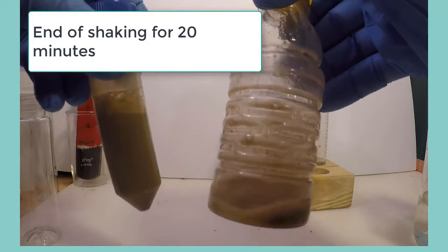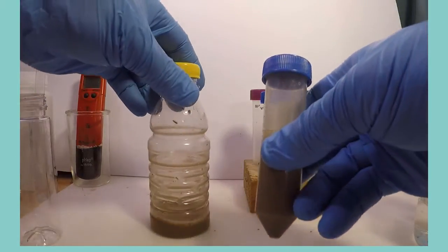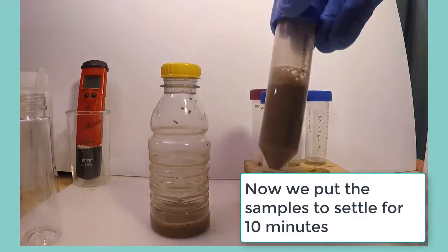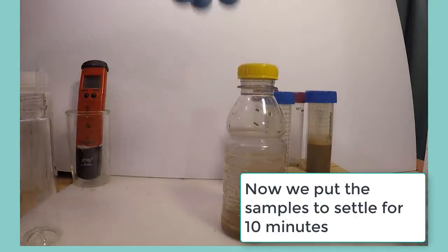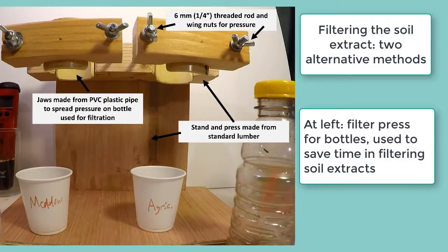Now the 20 minutes of shaking are over and we will leave the samples sitting to allow clays to begin to settle from the solution. The bottles or tubes need to settle for 10 minutes.